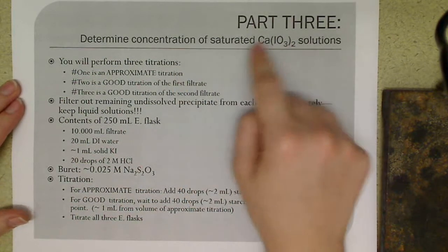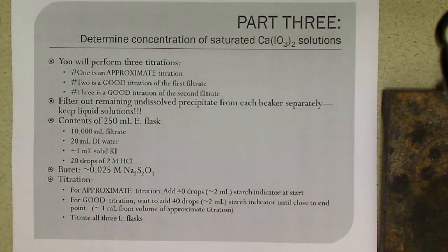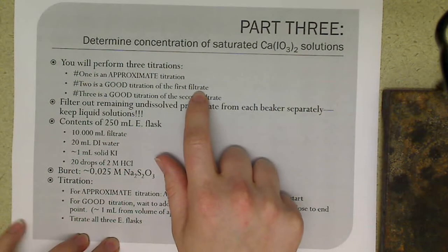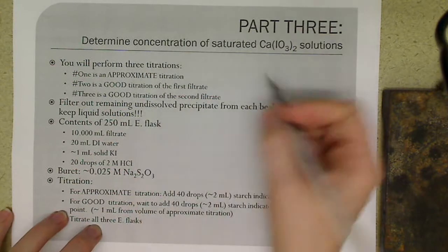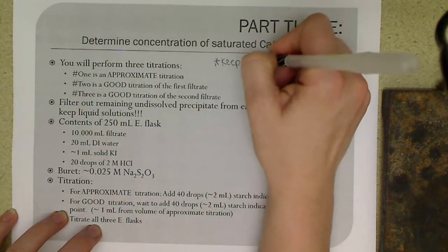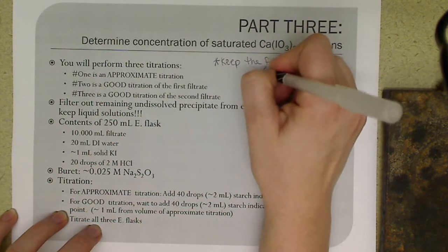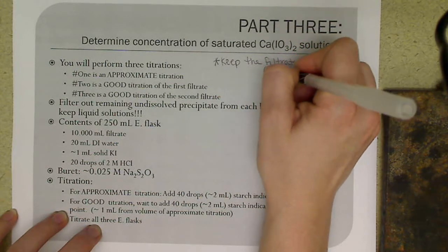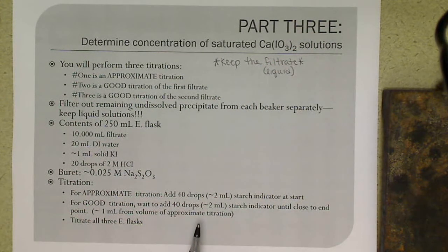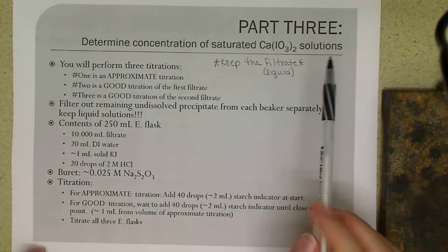So you're going to filter out your saturated solutions, except this time you're not interested in the solid. You are interested in the liquid, that we call the filtrate. So when you're separating, keep the filtrate, and that's the liquid. And you want to keep them also separately.